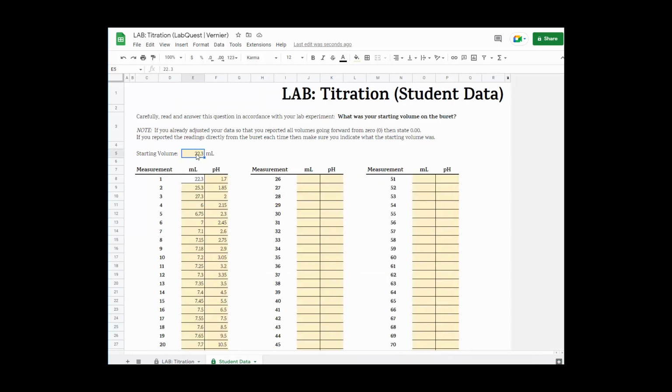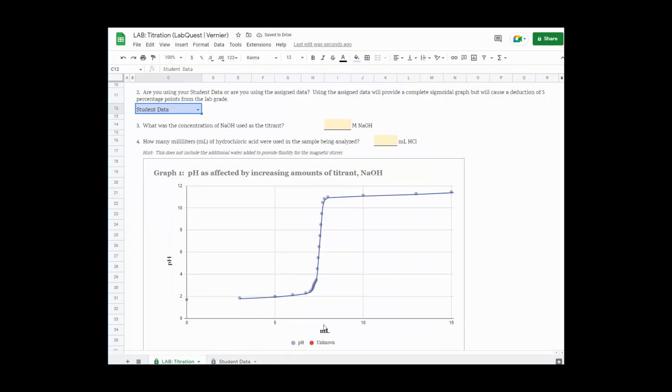Now, if you were one of the earlier classes, you would have stated that you started with 0, even if you were moving forward from a later titrant location, say that 22.3. I just made you use a calculator and figure out that you changed by 3 or that you changed by 5. Now when I go back and look at the graph, it's all fixed, no negative numbers, because it's subtracting 0 from everything.